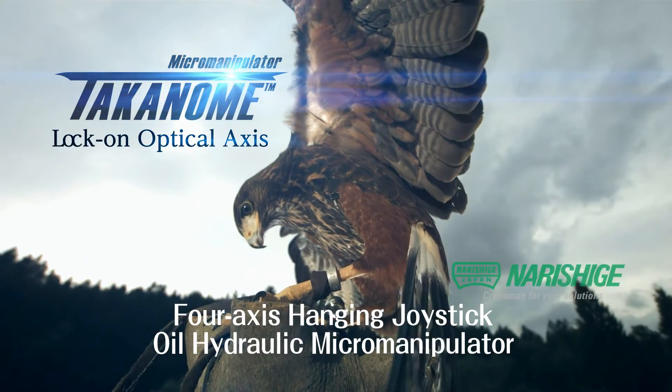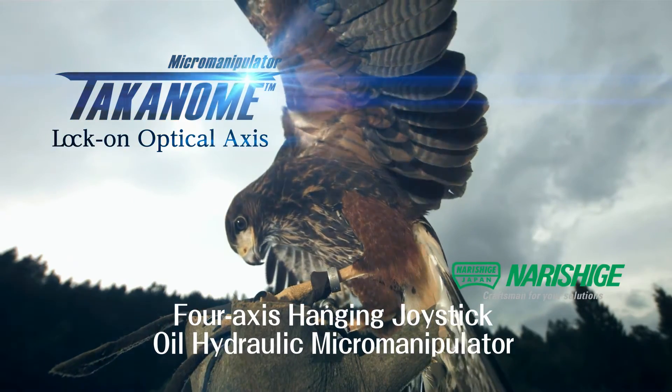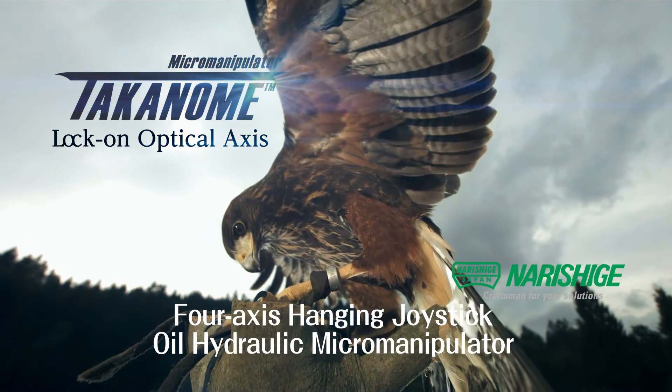Takanome, the 4-axis hanging joystick oil hydraulic micromanipulator.